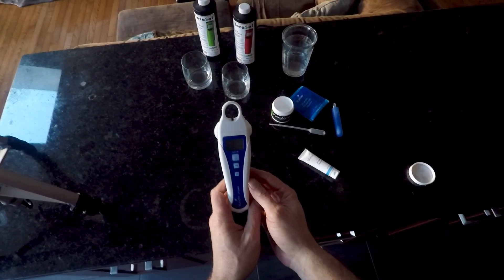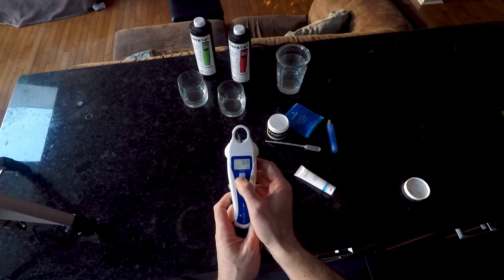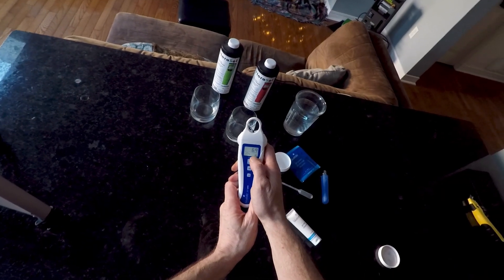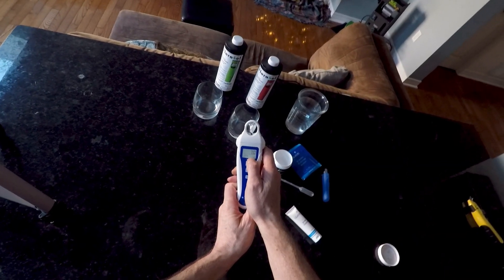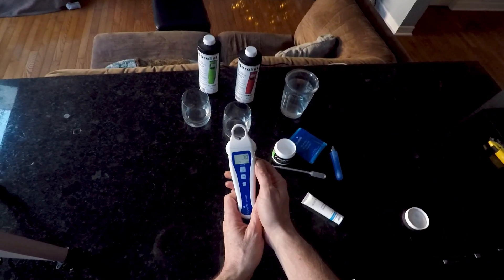Today we are going to calibrate our Bluelab pH pen. How do we know that it needs calibration? Right beside the pH you would see a check mark for as long as the pen feels like it is properly calibrated. When that check mark disappears, it's time to recalibrate. We're gonna do that right now.